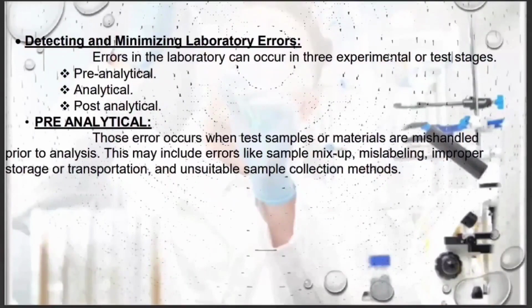To minimize pre-analytical error, ensure that proper sample collection methods are followed by adhering to the standard operating procedure. Samples and test material are clearly labeled using name or lab codes, date of collection, sources, and test to be done. Test materials are transported to the lab in proper containers and at the recommended temperature. For any potentially infectious or toxic sample, the triple packaging rule outlined by the International Air Transport Association regulation should be followed and proper warning labels attached. Samples and test material are properly stored to avoid negative impact on the quality of results.